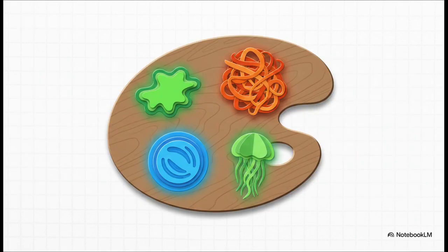Let's look at our roster of glowing molecular tags, because scientists have an entire palette to work with here. Fluorescein, or FITC, glows a brilliant, bright green and is heavily used to detect specific proteins. Rhodamine, TRITC, glows a fiery orange-red and is absolutely perfect for highlighting cell membranes and the structural cytoskeleton. DAPI is this remarkable dye that specifically binds to DNA, glowing bright blue.